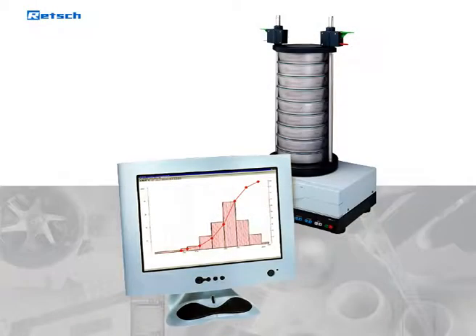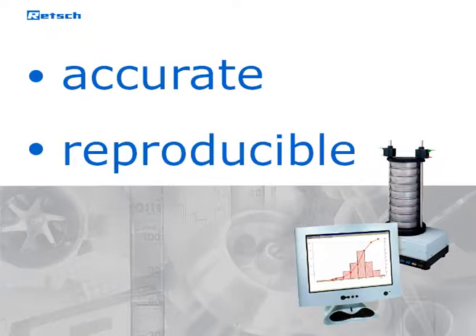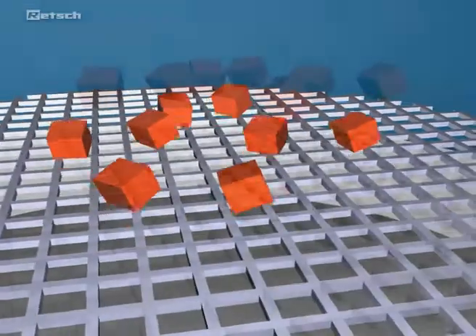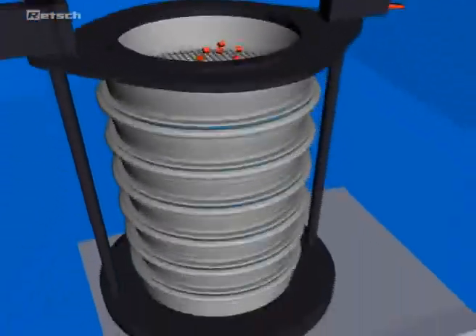Due to the unique technology in the design, our sieve shakers and test sieves produce accurate, reproducible, and fast sieving results in no time. This video shows you the operating mode, the innovative technology, and the many advantages the REC high-tech sieve shaker AS200 has to offer.